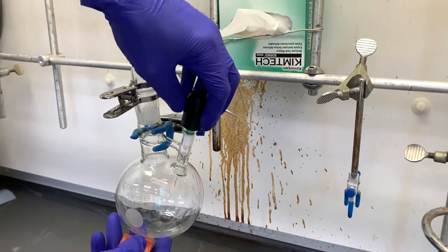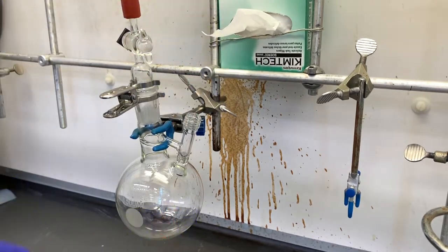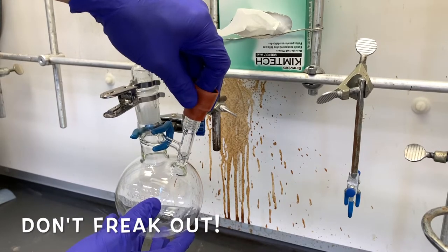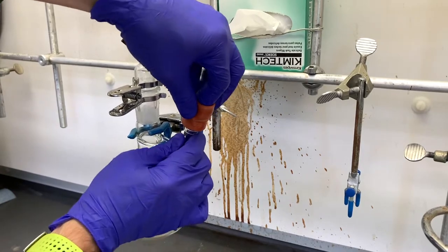At this point, you need to remove the Teflon stopper under flowing nitrogen gas and replace it with a rubber septum. This can be a pain in the butt, but be calm and persistent and don't freak out. As long as nitrogen is flowing out of the flask, your flask is safe from oxygen and water getting inside.